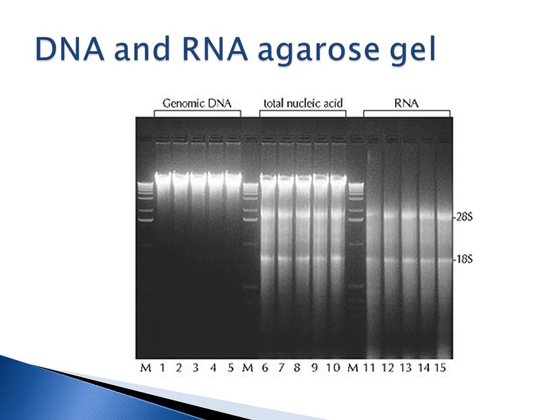So here is a picture of a gel, and you can see on the lanes that are labeled M, that is your marker. So you're going to run a molecular weight marker, and each band in your marker has a different size. So then you can compare your nucleic acid band with the location of the band in the marker, and you can estimate the size of that band.